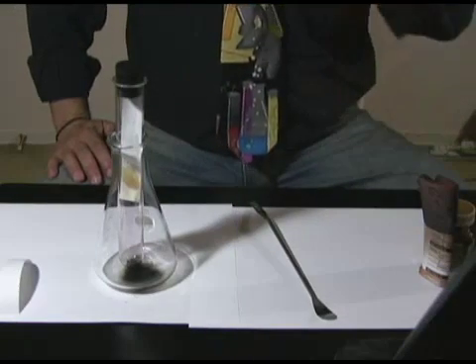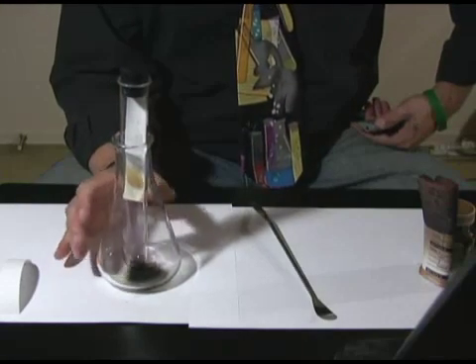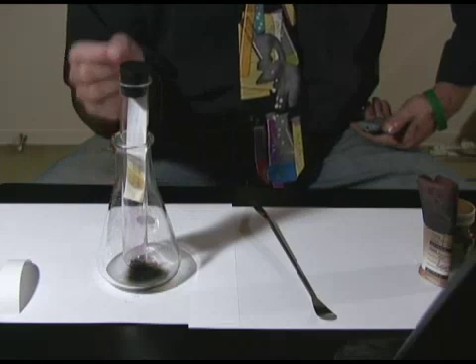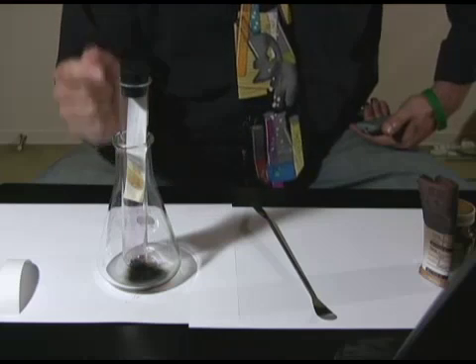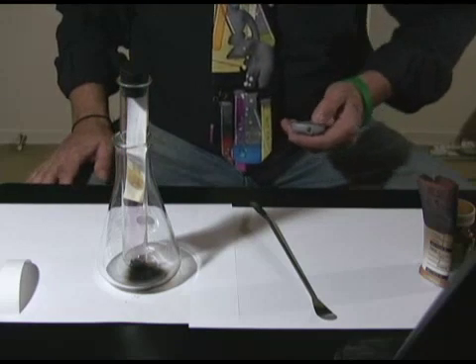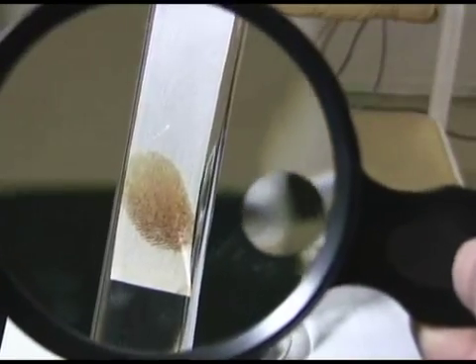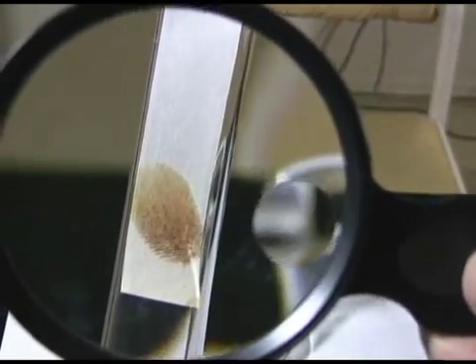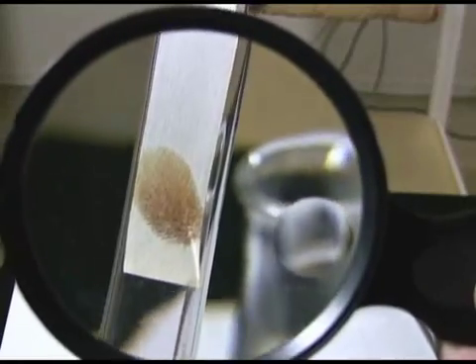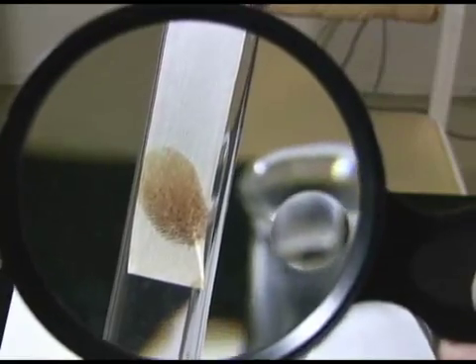After about a minute, you can definitely see something forming on the filter paper — see that brown smudge? The iodine gas came up and attached to the fat from my skin on the fingerprint. You can definitely see an impression of the fingerprint. We'll take a closer look with a magnifying glass. All the brown region is the iodine which attached to the fats — it's a little difficult to tell the exact pattern, but with a really nice print you probably could.